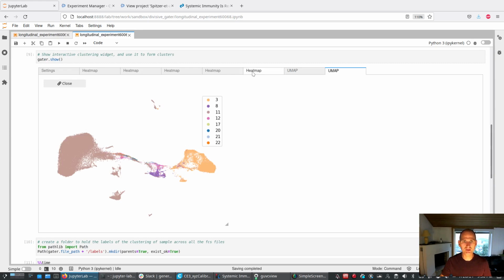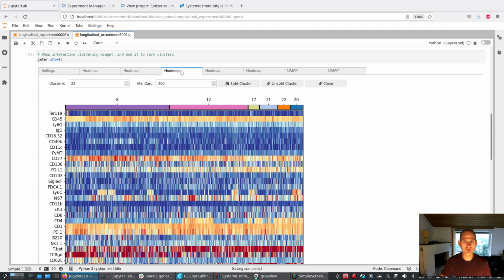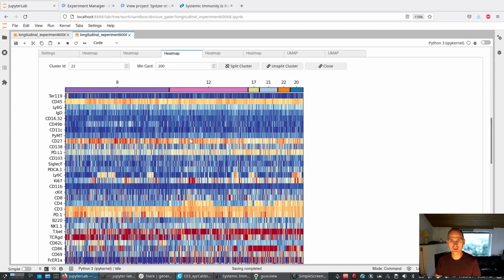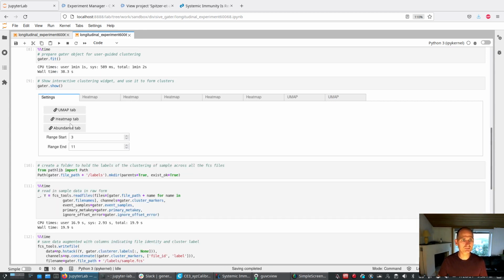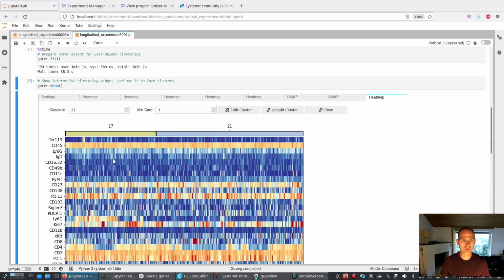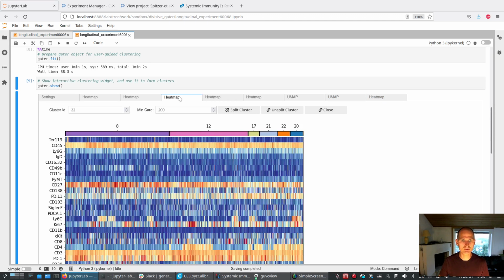What about the heat map then? So this was not the one, this was not the one. Here we have 17, 20 and 21, and maybe we want to make a new heat map from 17 to 21. So we can look at just, oh, I need to see, it was not from 17 to 21, it was from 17 to 20.